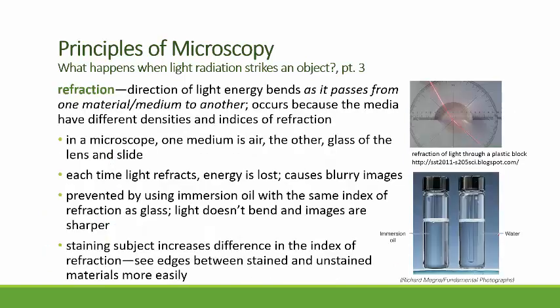Refraction is also a characteristic of many materials. Refraction is when we bend the energy as it passes from one material or one medium to another. And it occurs because of the different densities of the media and their index of refraction. So materials with different density tend to have different indices of refraction.